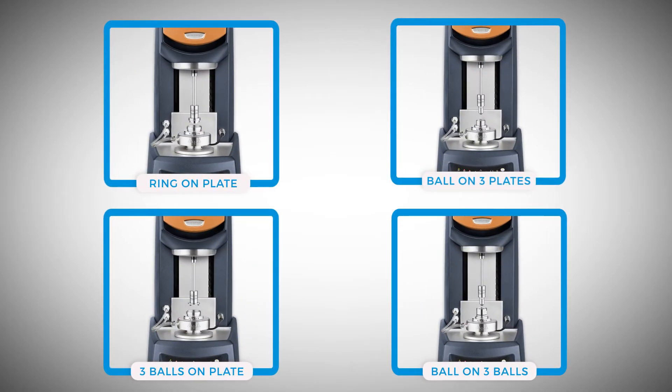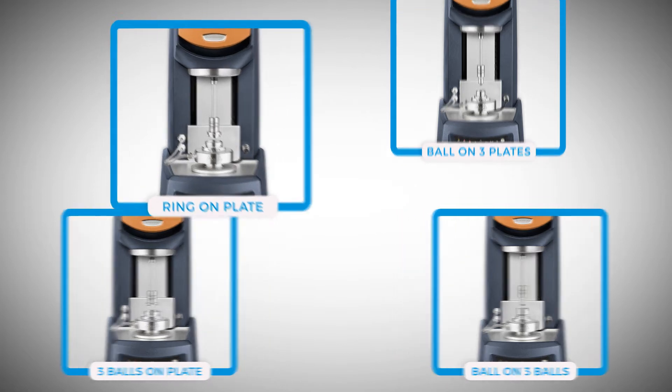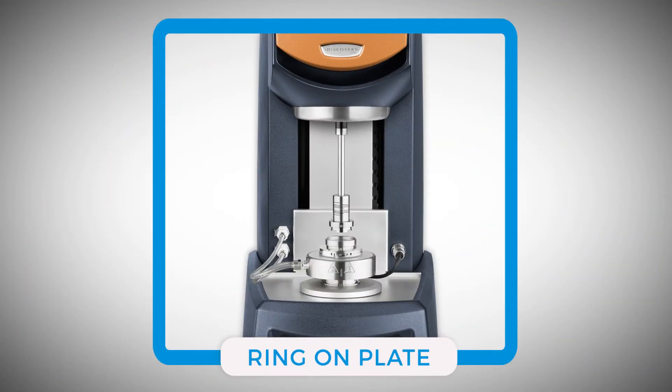TA Instruments' Discovery Hybrid Rheometer is equipped with four different types of Tribological Rheometry accessories. Among them, this Ring-on Plate Geometry provides a surface-to-surface contact and it is commonly used in personal care, food, or electronic industries for surface friction measurements.